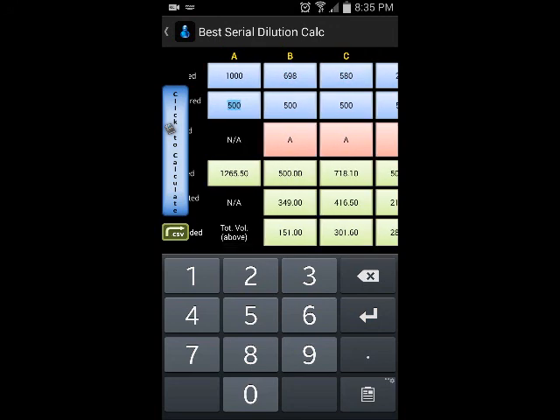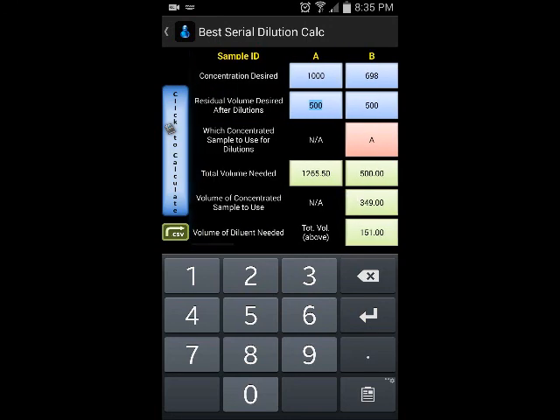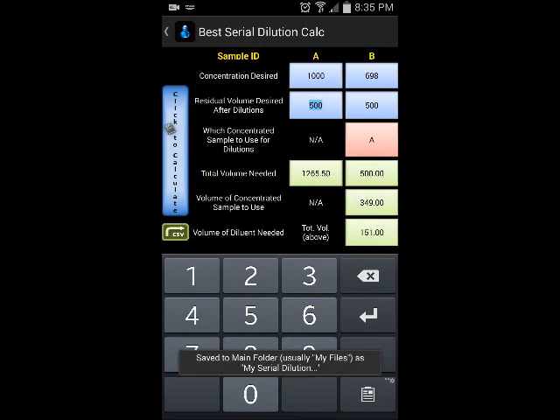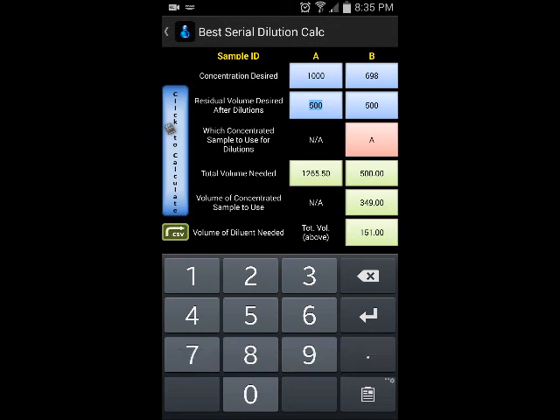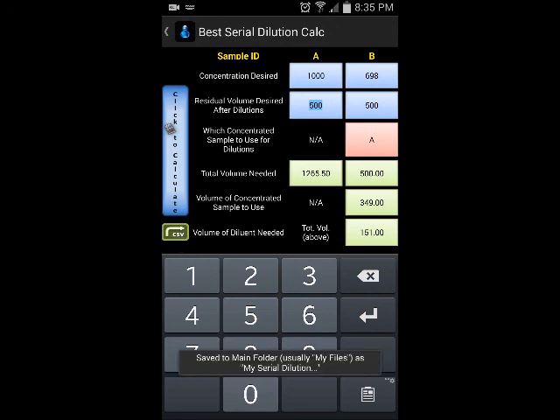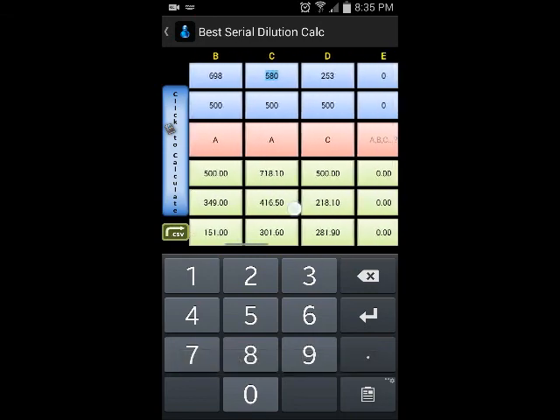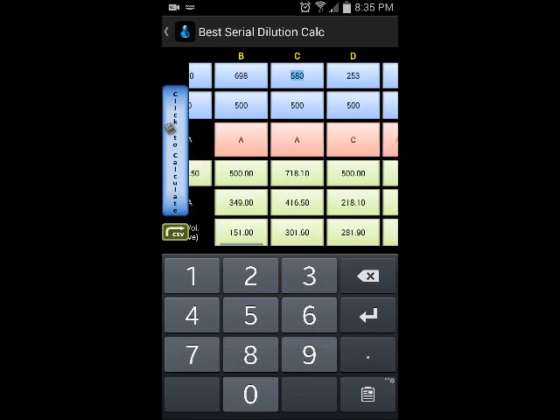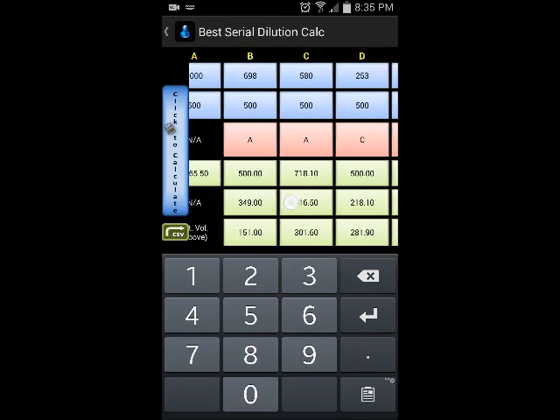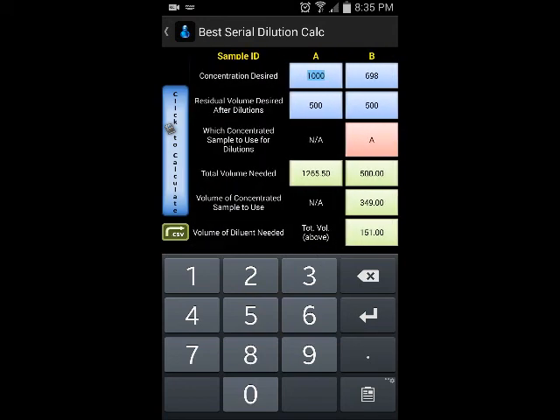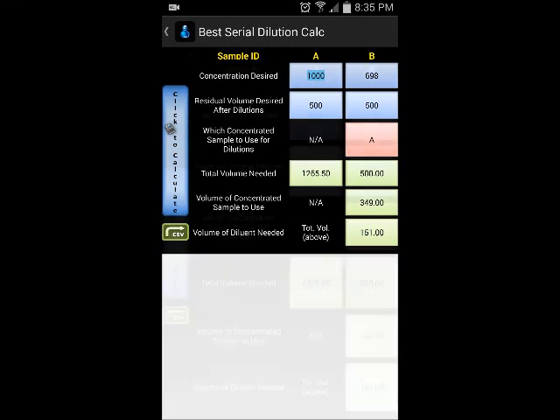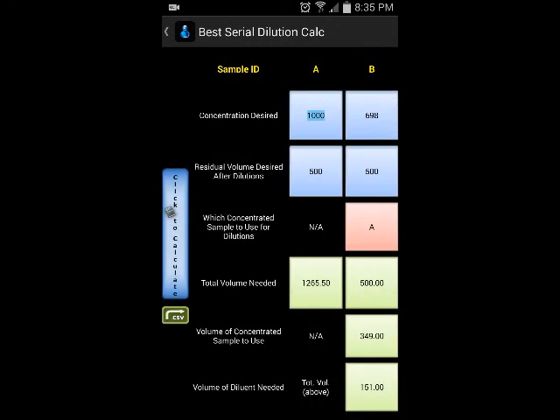I'd encourage you to pick a little extra to account for any loss during dilutions. Hit .csv and it saves to My Files as your serial dilution file. If you do this again, it'll save a new file with a different name in the same folder. You can then open that .csv file with any common spreadsheet program to print it or modify it as you wish.